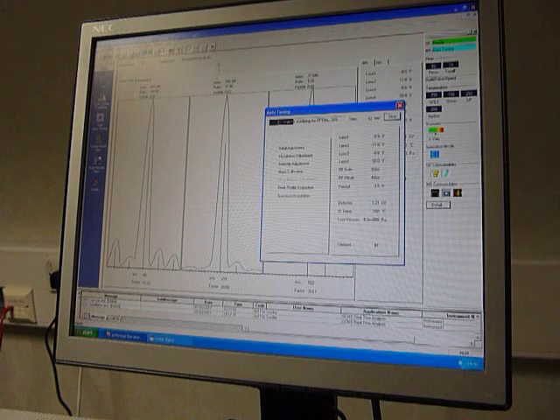Basically, what it does is look at three masses. It looks at mass 69, which is due to the CF3 of the molecule. It looks at mass 219, which is the CF3, CF2, CF2, CF2 part of the molecule. And mass 502, which is the whole molecule minus the CF3, CF2, CF2. It then goes through this automatic regime — ticks and checks, resolution adjustment, intensity adjustment, mass calibration — and this will never be more than half a mass unit out. That's very important.